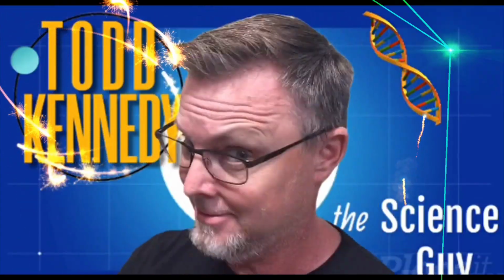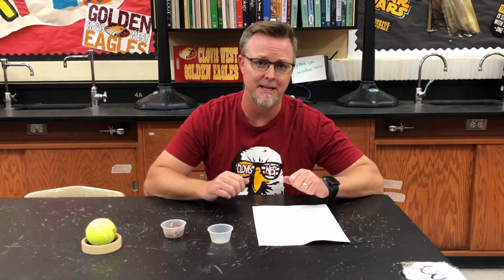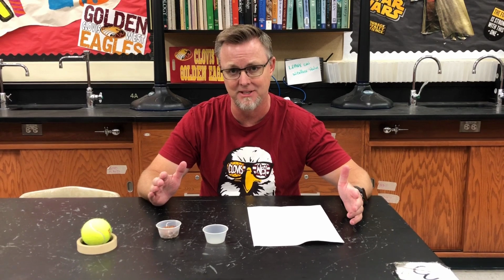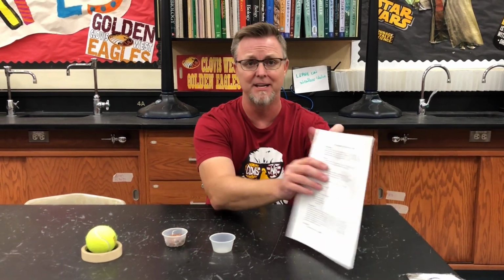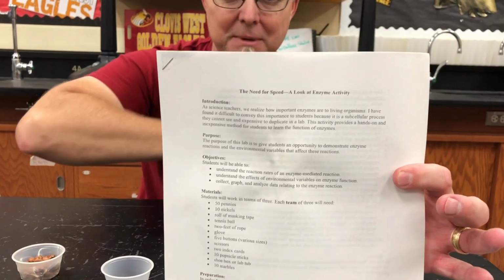Hey CW Bio, Mr. Kennedy here again. Today we get to do a very special activity to learn a little bit about how enzymes work. It's called the need for speed. If you go to our class webpage, look under all the handouts for biology there, you need to find the one that looks just like that, the need for speed.